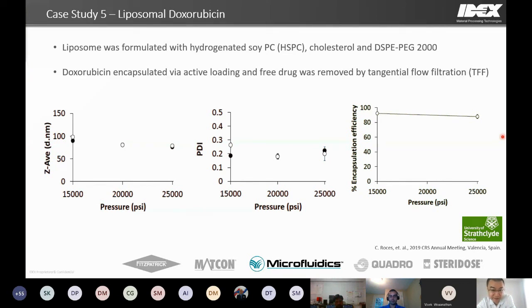Both techniques use a laser-based measurement. This one relies on the theory of dynamic light scattering, DLS. The average size is the mathematically averaged particle size, so in general you can look at it as somewhat close to the mean size. And PDI, as I mentioned, represents the distribution.